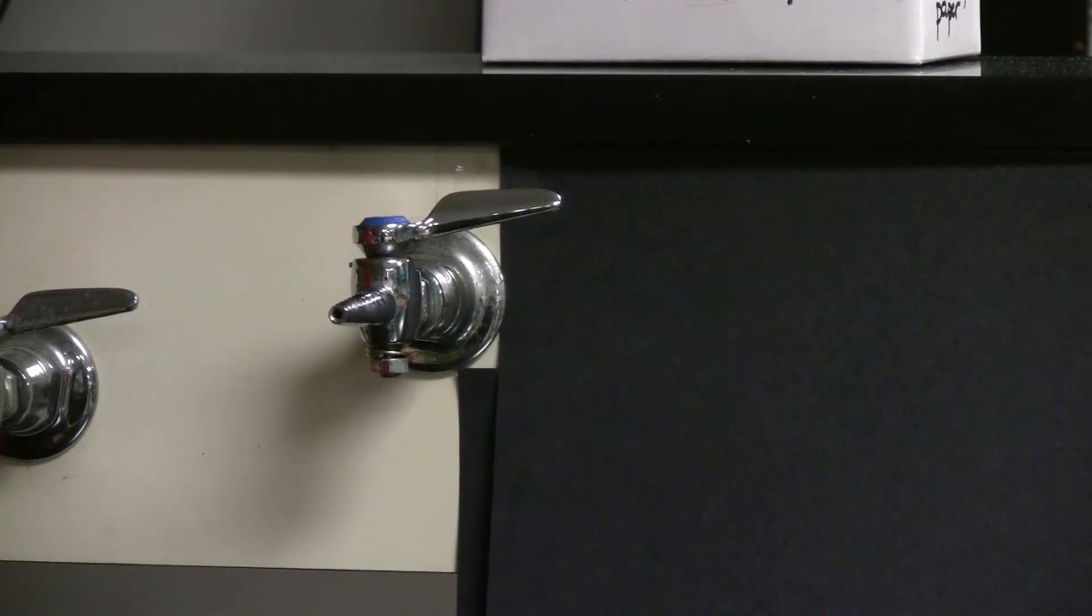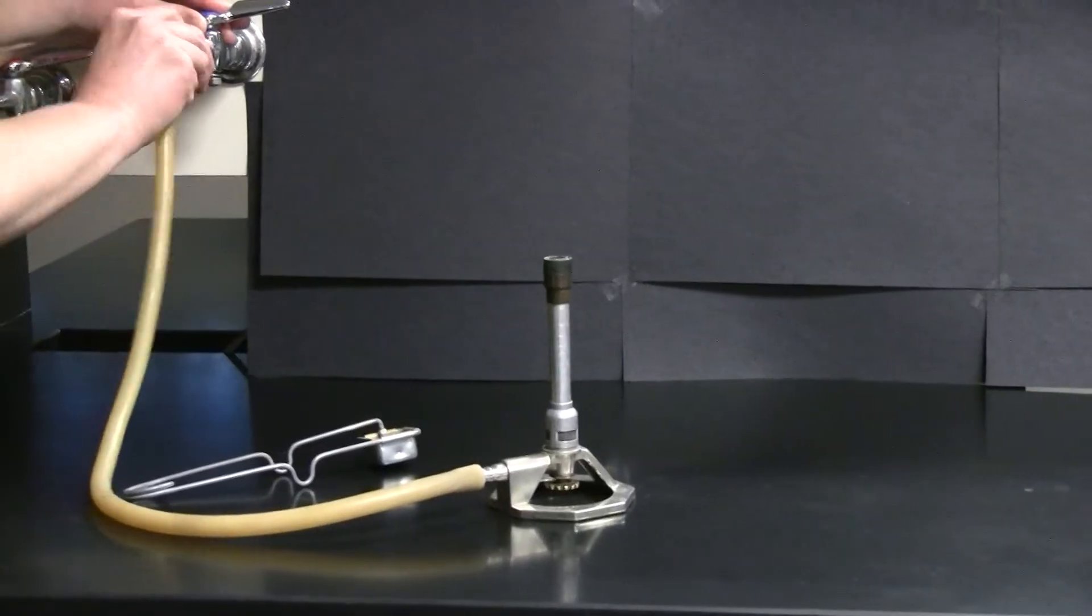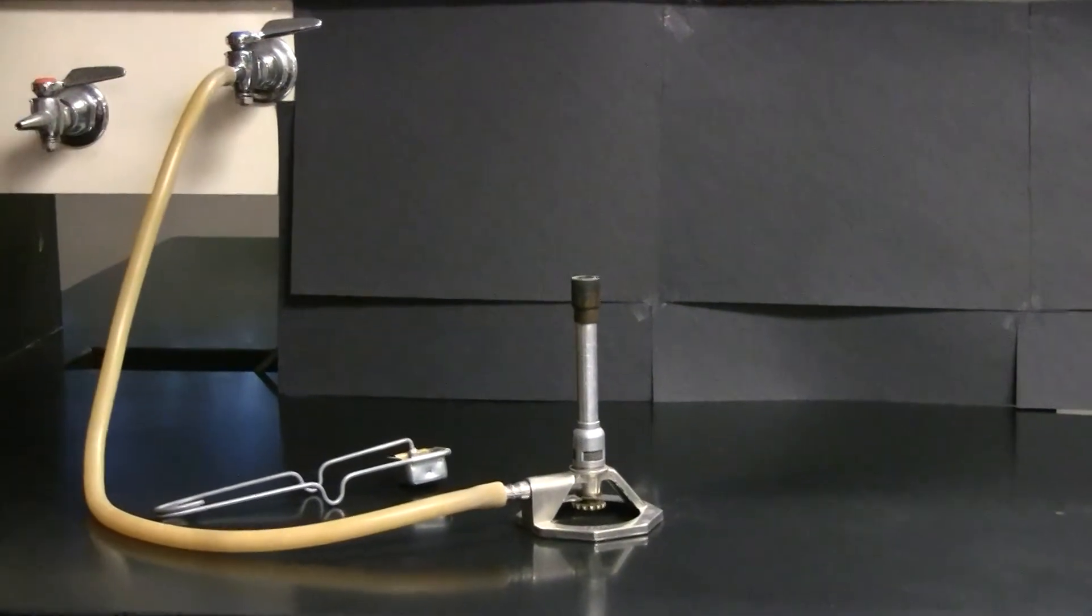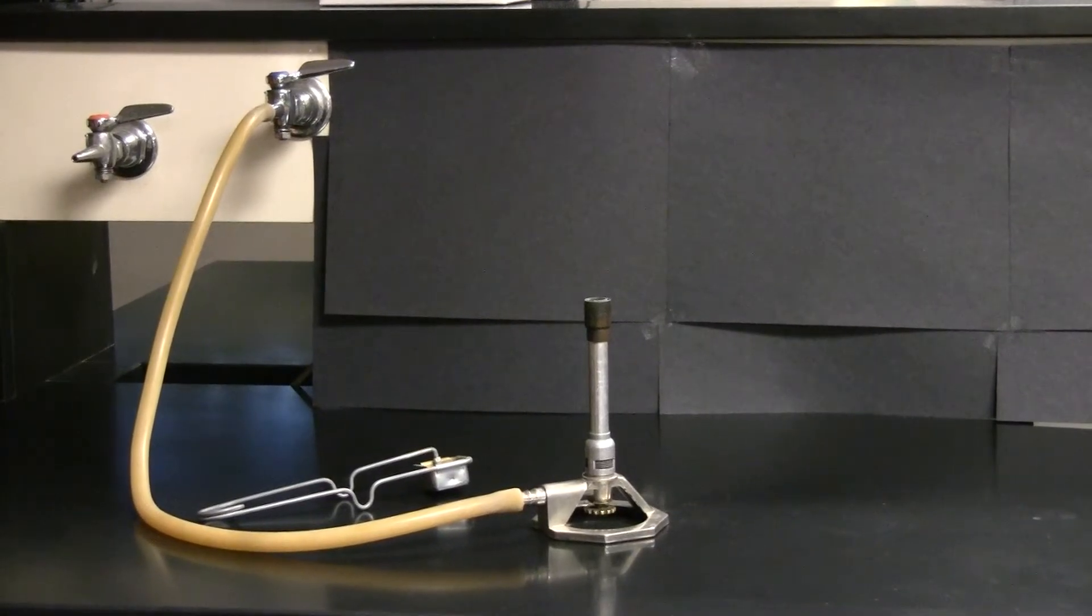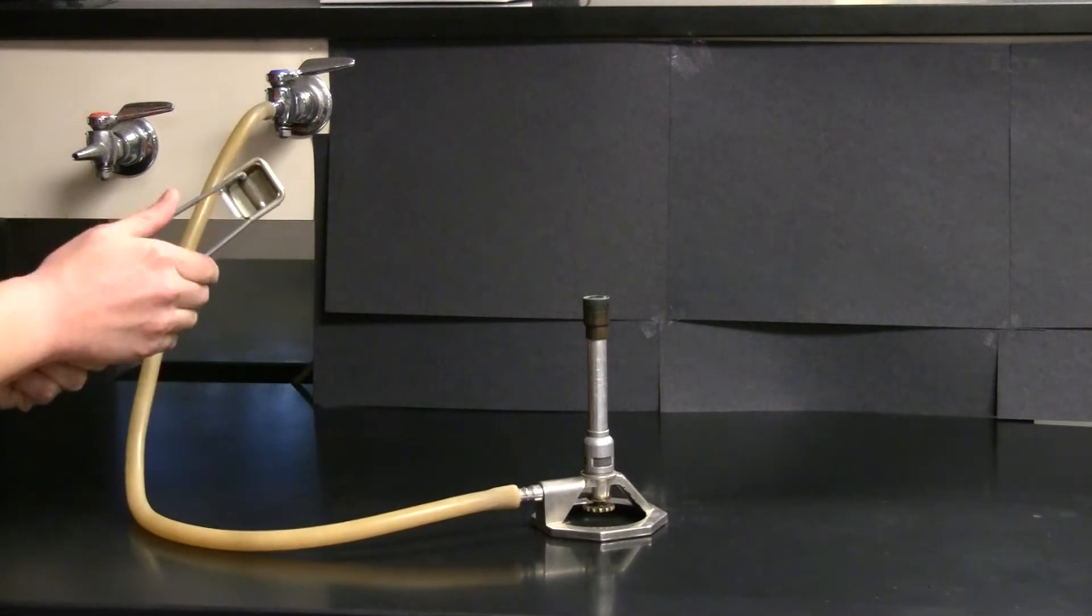Now let's get ready to light the Bunsen burner. Attach the hose from the Bunsen burner to the gas inlet valve and nozzle on the bench top. Make sure that the hose is on securely. Practice a few times with your striker again just to make sure that you're going to get good sparks.